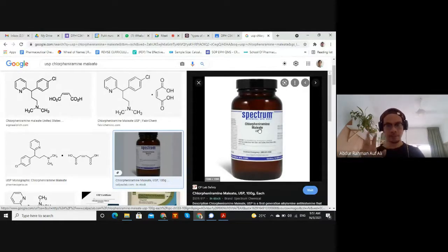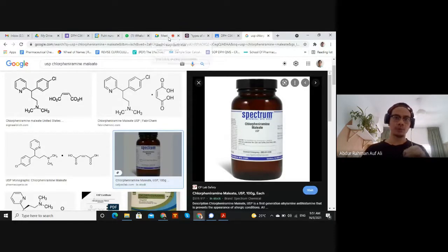And of course, kalau kita nak prepare ni, nak hancurkan tu, nak gunakan berapa banyak powder is based on the STP lah, berapa gram nak timbang tablet ni. Okay, 5 gram. So timbang 5 gram, masukkan dalam volumetric flask, top up with solvent sampai 100 ml for example, make sure everything is dissolved, and then put it in the HPLC, high performance liquid chromatography instrument, and run the samples, the standard and the sample solution. And in the end kita boleh dapat bacaan from the computer. Tengok kandungan sama ataupun tidak, 100% ke 50%. Okay, so this is in essence, in a nutshell also, how do we perform analysis.